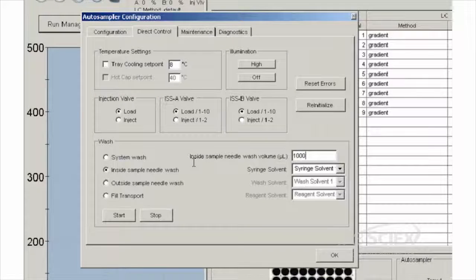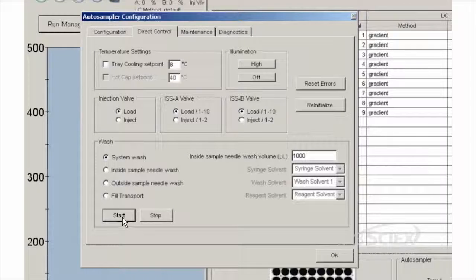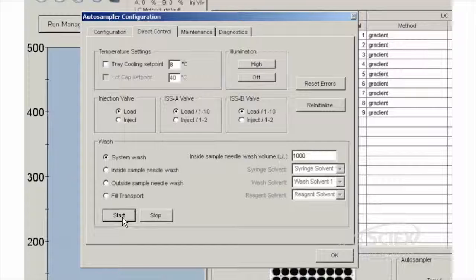Perform a system wash of a thousand microliters. After clicking Start, wait until the Auto Sampler is idle, then click OK to close the configuration window.